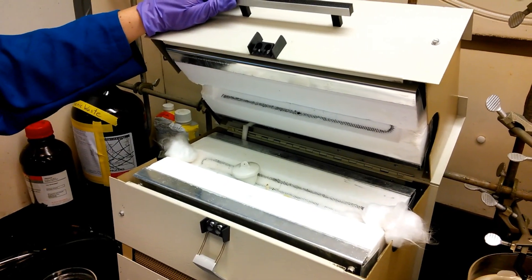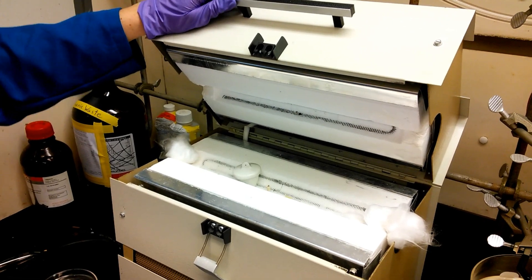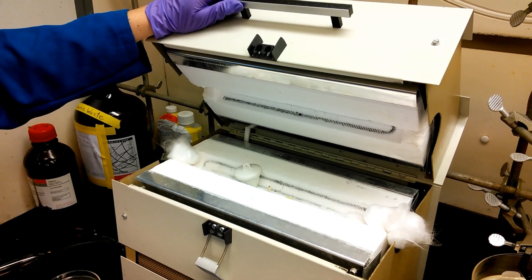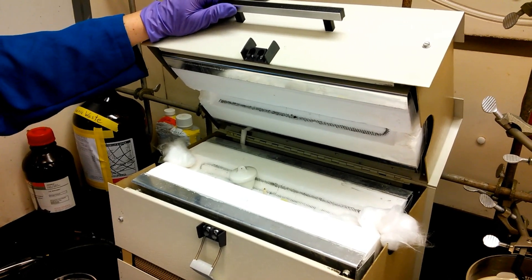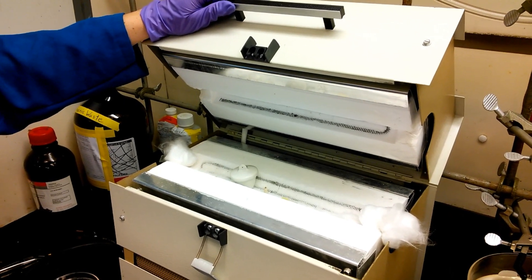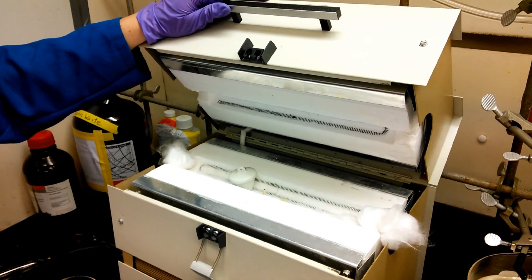The last step in our filmmaking process is to heat our film to 500 degrees Celsius in a furnace. This removes any residual water and converts our tungsten oxide to the monoclinic crystal structure.